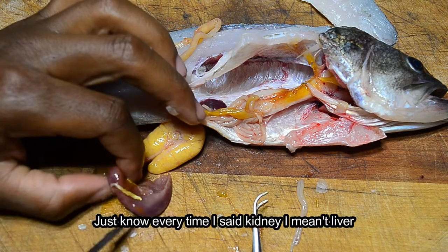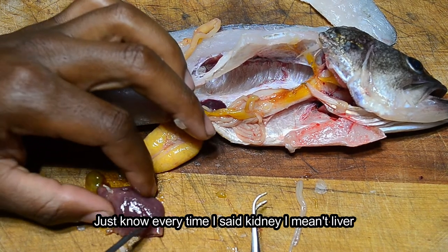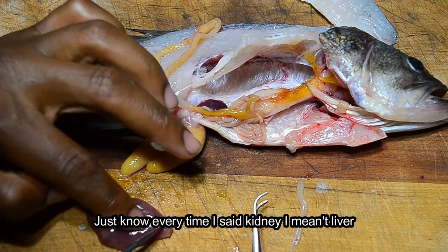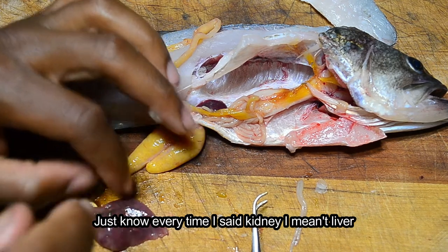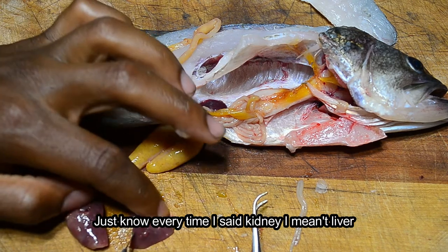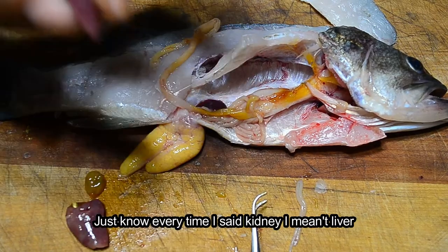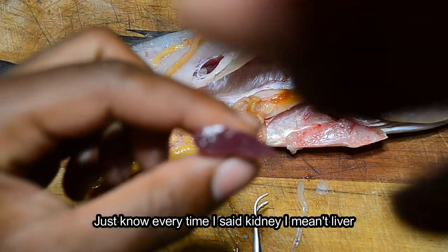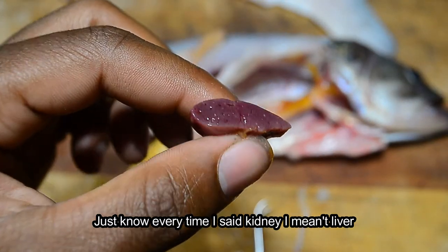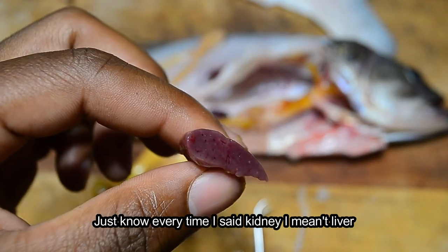The kidney — wow, this kidney is actually quite big. You can see the blood vessels in the kidney. Let's see what it looks like cut in half. Cutting straight down, you can see all the veins in there.